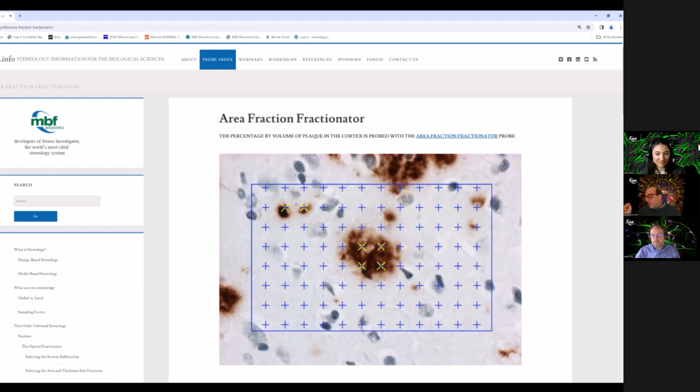Either look at the means of the surrounding sections and just put it in there, or use a neighboring section. Definitely don't do it with more than one section. That would be up to you, whether you wanted to slightly compromise your data like that. And of course, you'd want to report it.